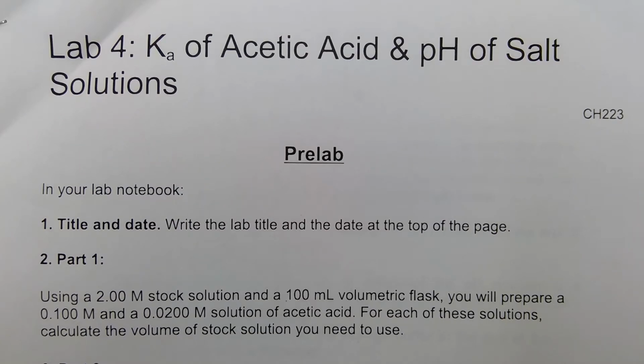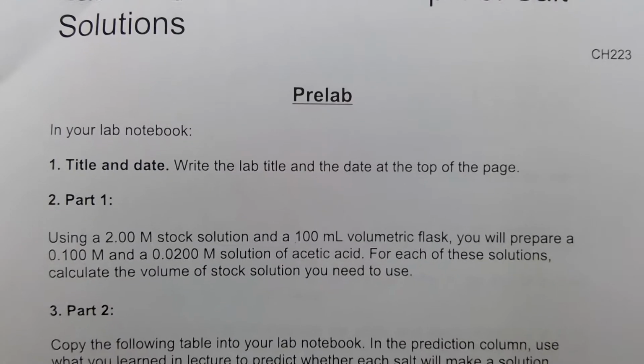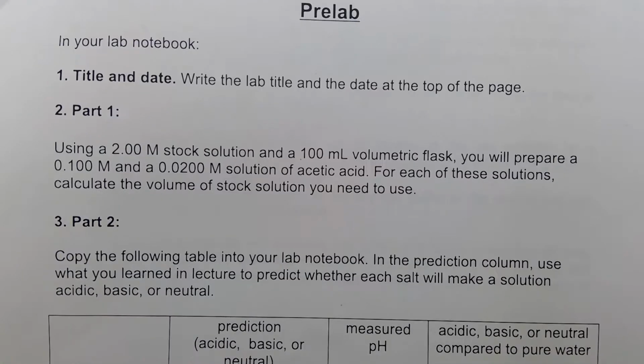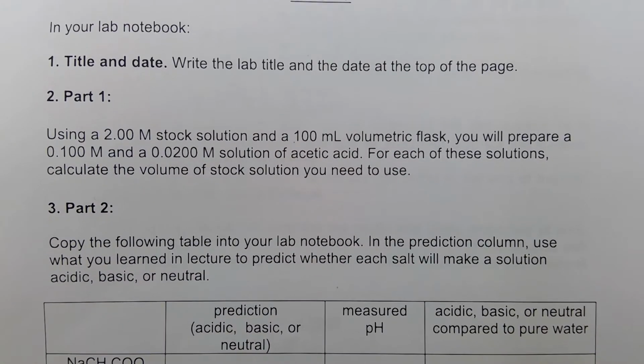Hello, this video is for Chemistry 223, Lab 4, Ka of Acetic Acid and the pH of salt solutions. I just wanted to make sure that you guys know to do the pre-lab before beginning, because there's some calculations that you need to do.